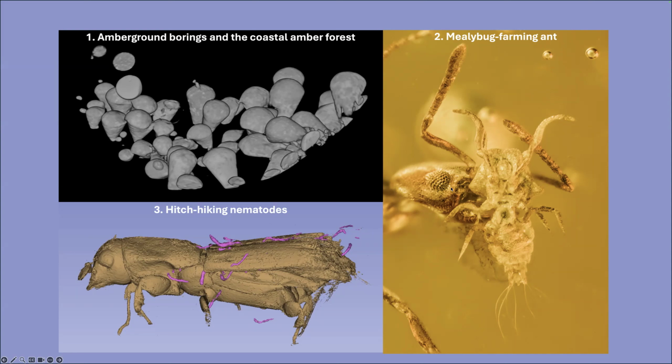And then here what have we got? We've basically got much better images, both photographic and in 3D models. And we have a much better set of measurements. But I'm not really sure what to do with this one. So I put it on a preprint server for ant specialists or mealybug specialists that will find the information useful. And this one I've also not done anything with yet. And sometimes it's like that.